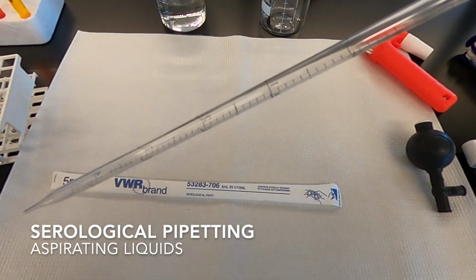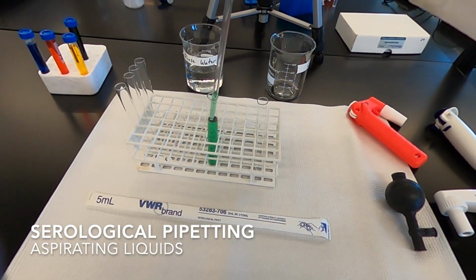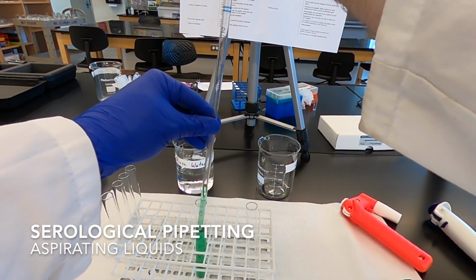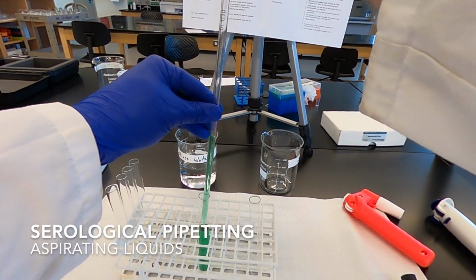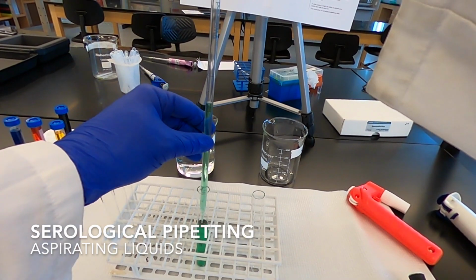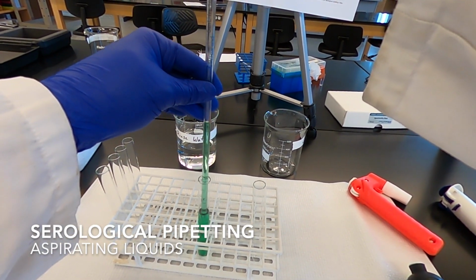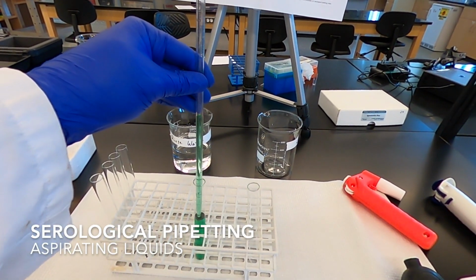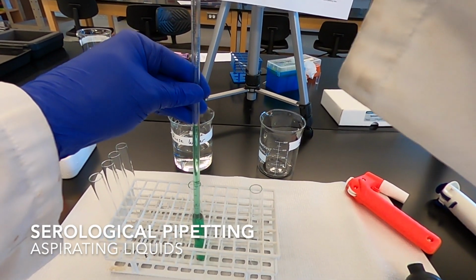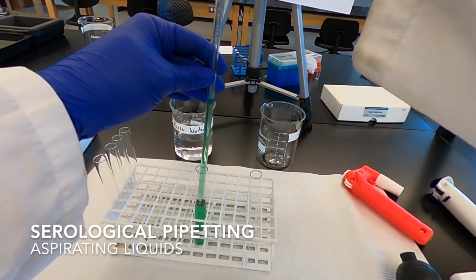When you are pipetting, typically you use one hand to hold the pipette, to guide it, and the other hand to pump with. So you just put the tip into the liquid, and then you gently use the pump. When you're pipetting, do not push the tip all the way into the solution. Like, I don't need it to touch the bottom. That'll just get water up on the sides of this, which can mess up your volume transfer.